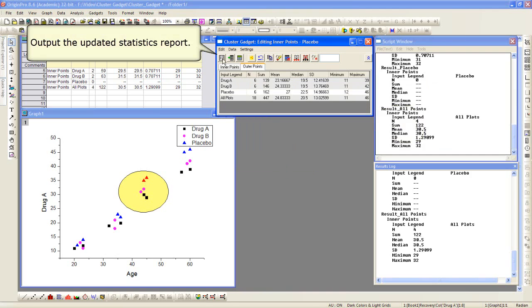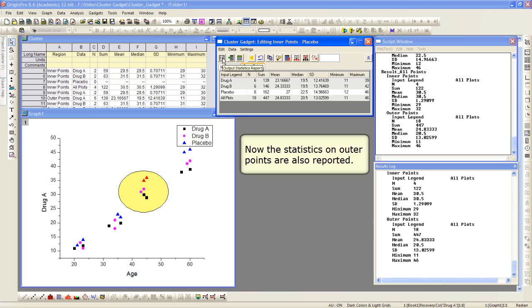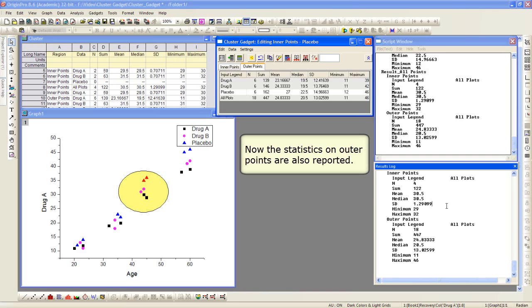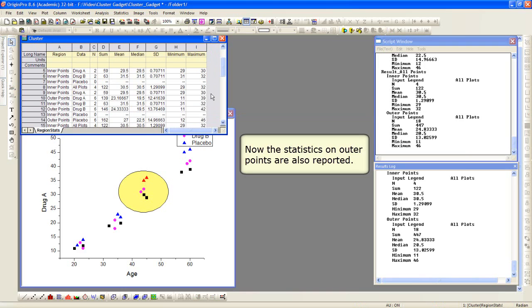Again, we can output the updated statistics report, and it will append new rows in our workbook. The statistics are also output to the script window in the results log we see on the right, and you may have noticed on the left, new rows were appended to that existing workbook.